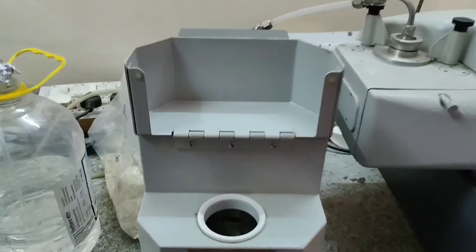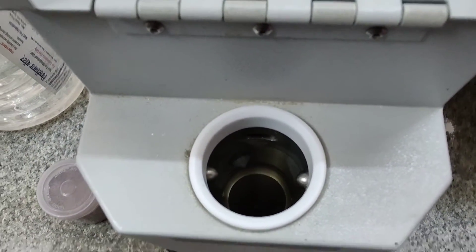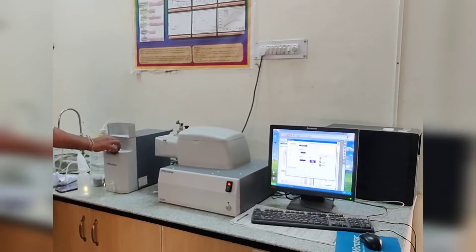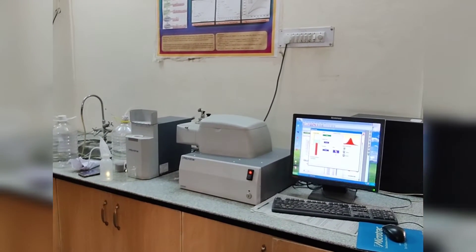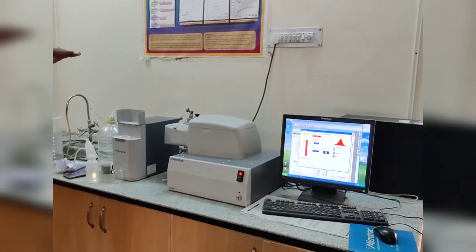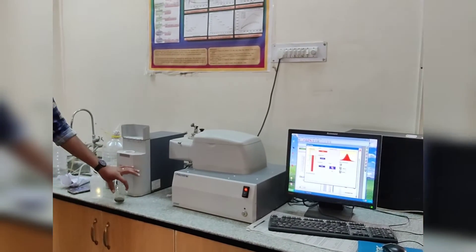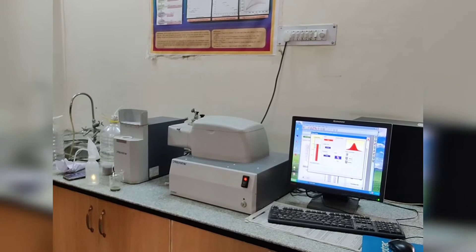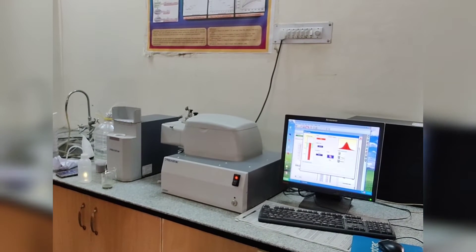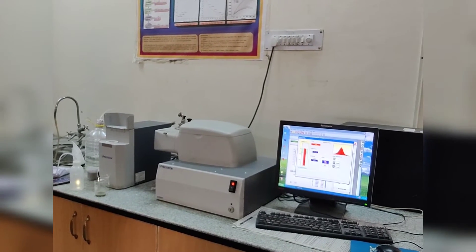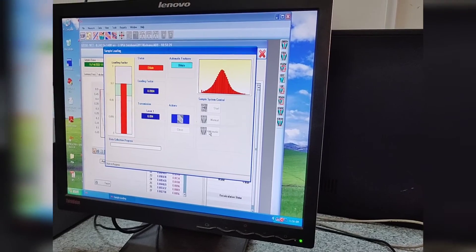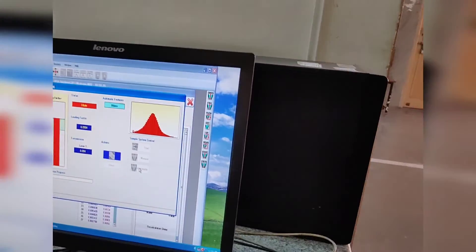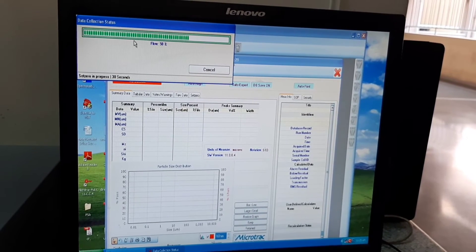Initially, the water is strained through the analyzer so that it is filled with water, and once the calibration is done, we add the sample in such a way that the dilution amount remains in required region.